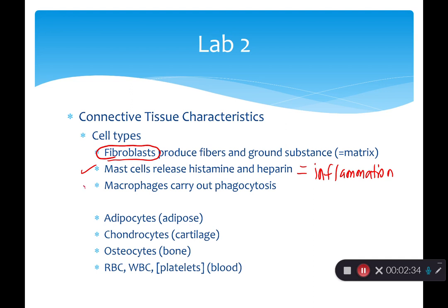Then we have macrophages. Macro means big. Phage refers to phagocytosis. Cytosis means cell. The phage or phagocytosis part means eating. So these are big cells that eat. So they fight off infection.